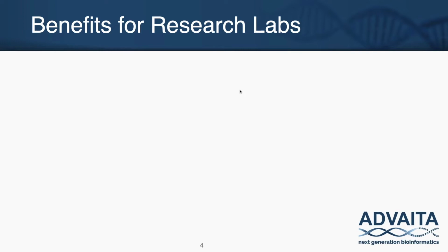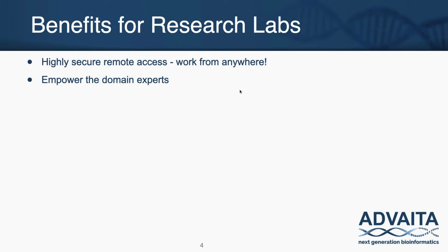And here are just a few of the benefits for researchers. The first one is that it's highly secure remote access. This is a cloud-based platform, which means you can access from anywhere. You can receive a link to your results by email, and you log in through your browser. And whether you're at home or at the office, or one day when we start traveling again at a conference, you'll be able to log in and interact with your results.